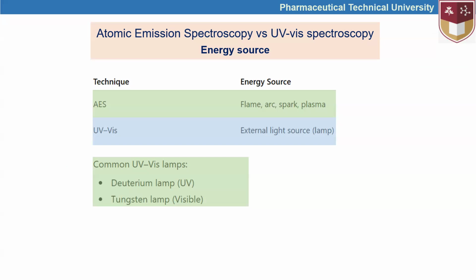It's not wrong if we say from some closer ranges of ultraviolet to infrared as well, based on the types of tungsten lamps. And the deuterium lamps develop the light like monochromatic. In this case, the light is filtered, and monochromatic light can be generated. Next.